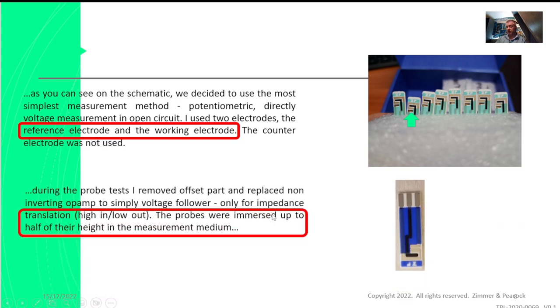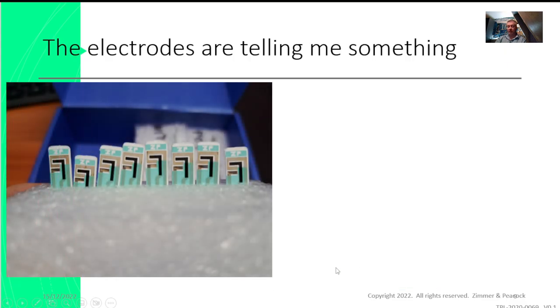We do understand how you're testing it. It's completely fine. This is the way we would test it as well. Immersing in a beaker about halfway is completely fine, so that's not an issue. But I said it before, the electrodes are telling us something. When you look at the electrodes, you've got a lot of oxidation on the counter electrode.